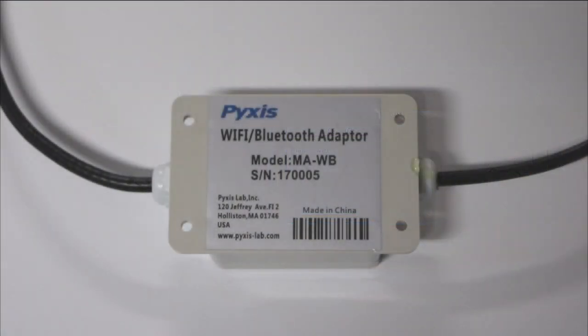The SP910 will identify the ST500 probe via a Wi-Fi and Bluetooth adapter available from Pyxis. This adapter is necessary for the wireless calibrating shown in this video. It must be installed between the ST500 probe and your water treatment controller.